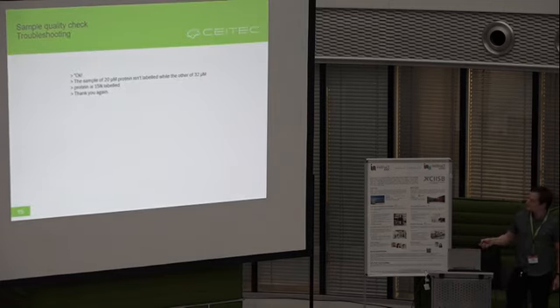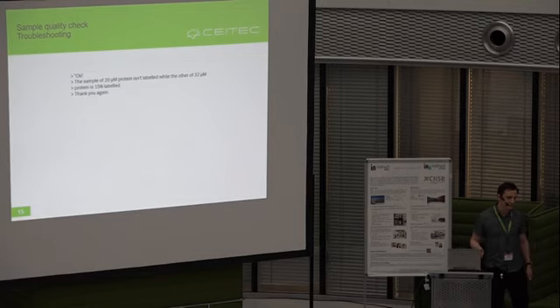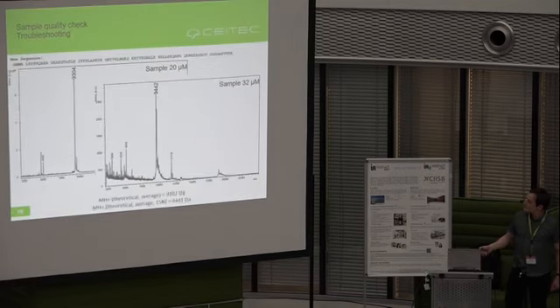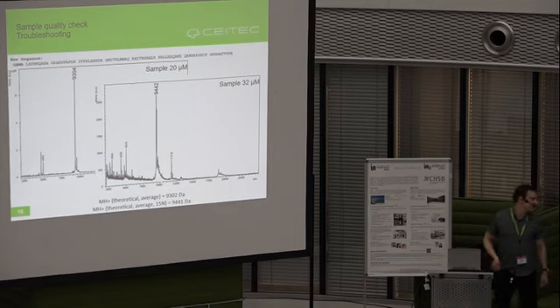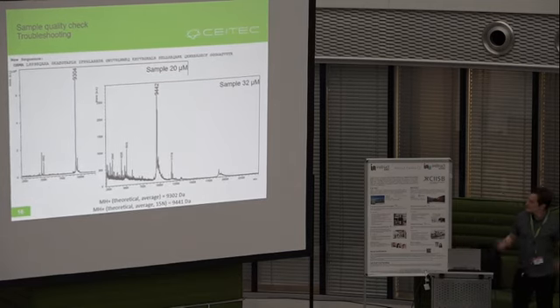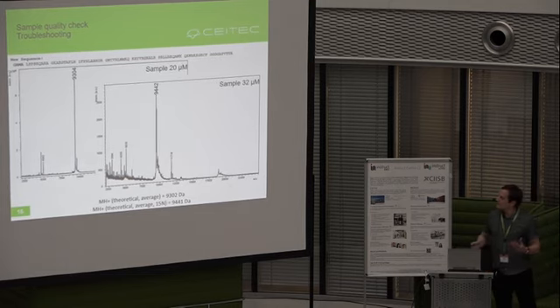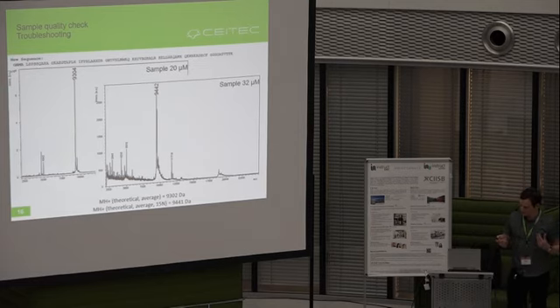And then we obtained the expected response from the customer. He didn't tell us that his protein is N15 labeled. He supposed that this information was not important for us. So finally, we can go back to intact mass analysis, where when we calculate the molecular weight of the N15 labeled protein, we see that it is in perfect agreement with our analysis. So this is just to demonstrate to you what we can do in case when the intact mass analysis seems to fail, but I think the communication with the customer is the principal thing that can save you much time.